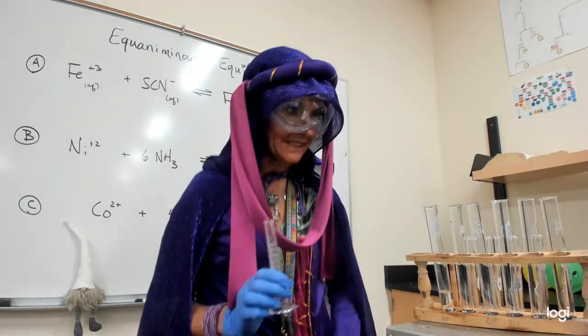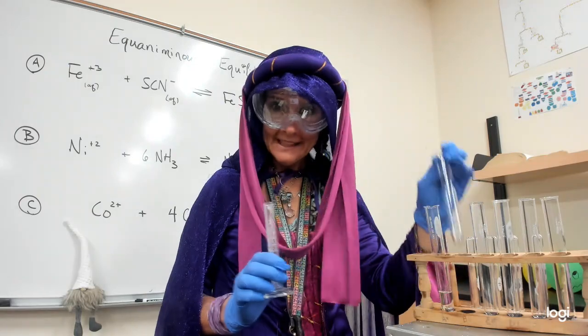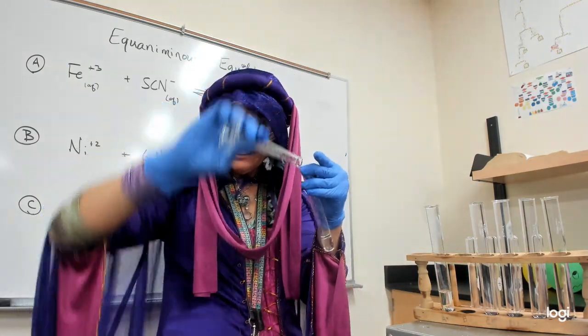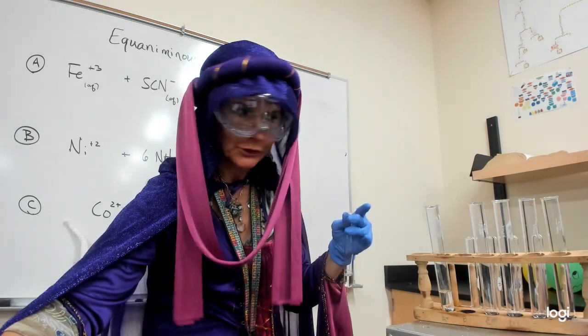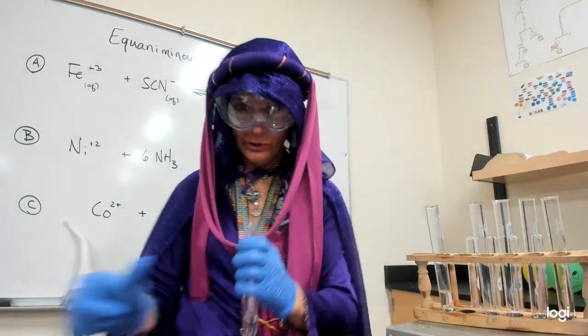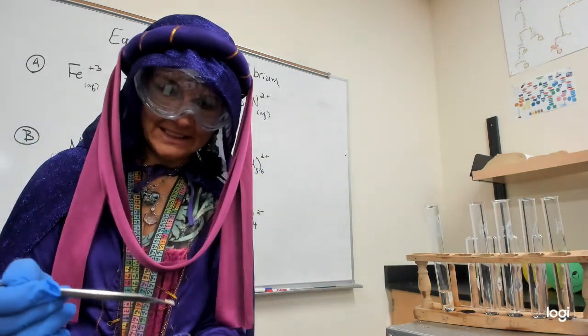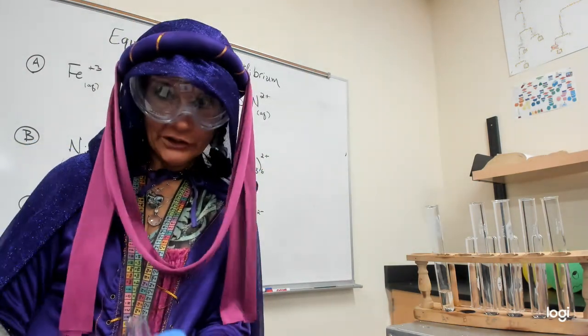This is what you're missing, the excitement. Test tube, water. Did you see that? I even wore gloves to make sure I was extra careful. And now, this is actually the really exciting part. We're going to add a few crystals of iron nitrate.